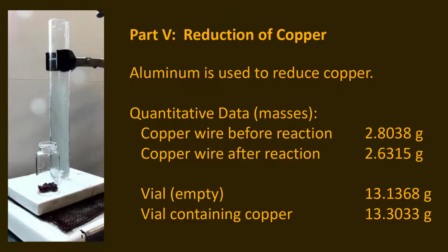So now if I'm going to weigh it, I got to get rid of the water. And a standard way to do that is to add a drying agent. In this case, what we're going to do is add some methanol.